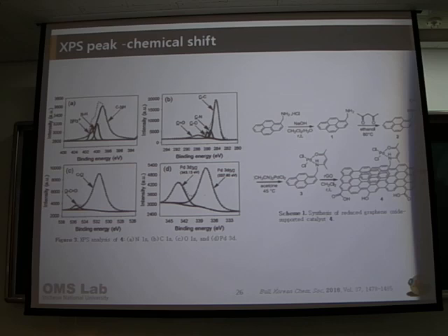The one that you have shown is ammonium. Yeah, the one that you have shown is ammonium. This is another piece of evidence that you have a coordination, because after coordination, the nitrogen has four bonds. Although three are equivalent, one is a coordination bond. That's what you want to say. So from this ammonium peak, the N plus charge demonstrates the formation of the coordination. You understand? Yes.